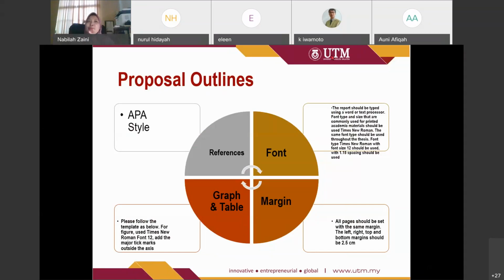Also, please make sure that the selected organic compounds are not similar to the other groups'. If you know what the other groups are doing, please make it a variation. And the procedure must include the purification of the compounds too. Yes, the procedure for the sublimation should be clearly stated for subliming the selected organic compounds.